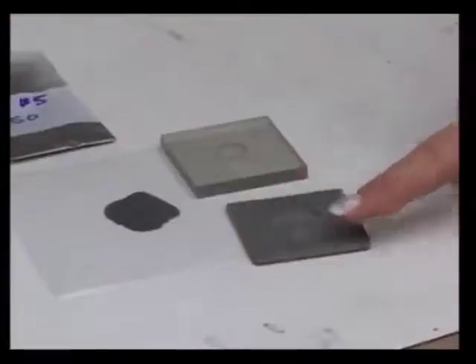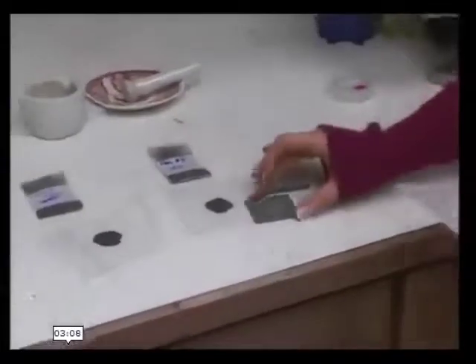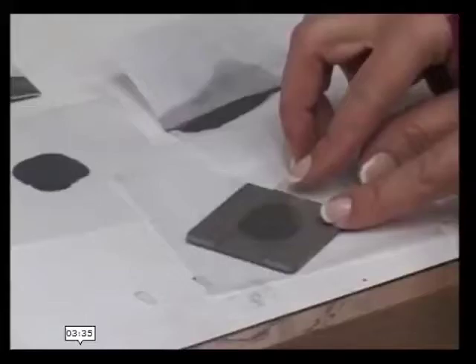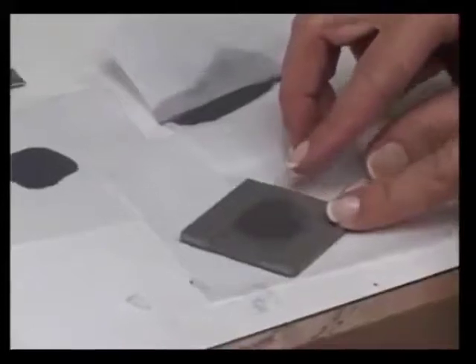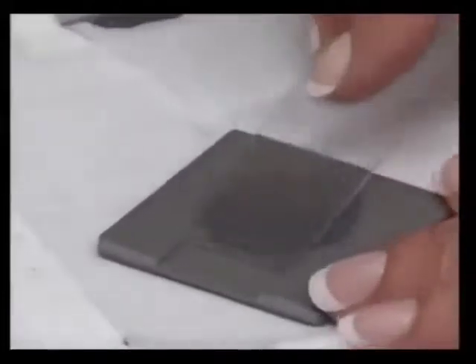Because, as I said, the more particles that you have represented on this surface in all of the various crystal planes, the better your data gets. You're welcome to come in and use our sample holders. You want to make sure that it's filling the well, but it's still flat with the surface of the sample holder. And you just gently scrape off whatever comes out of the well.